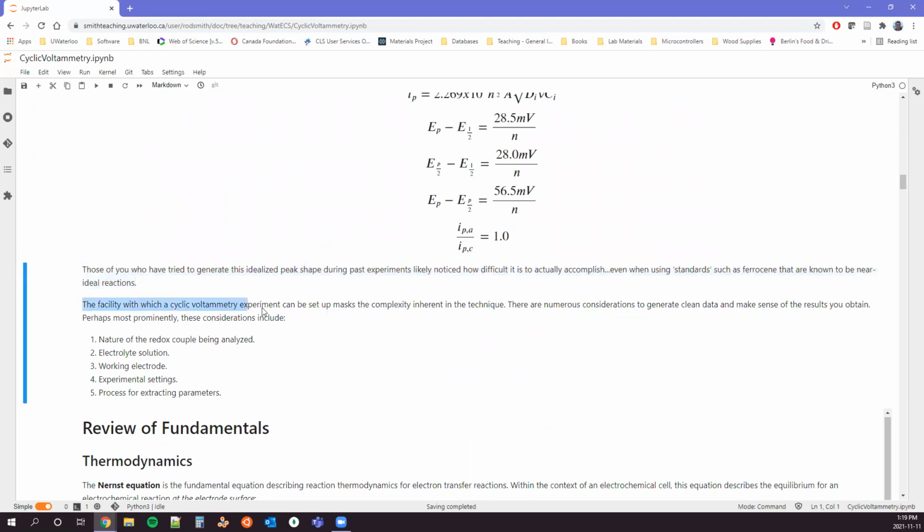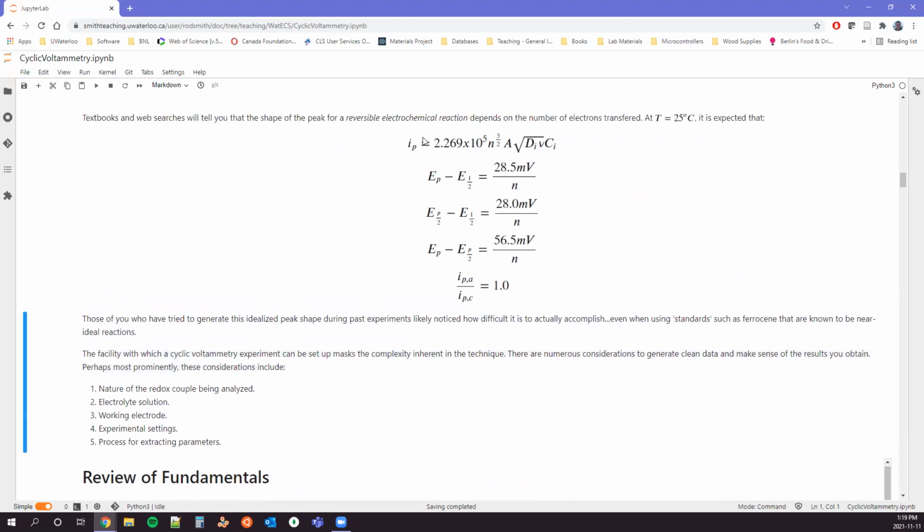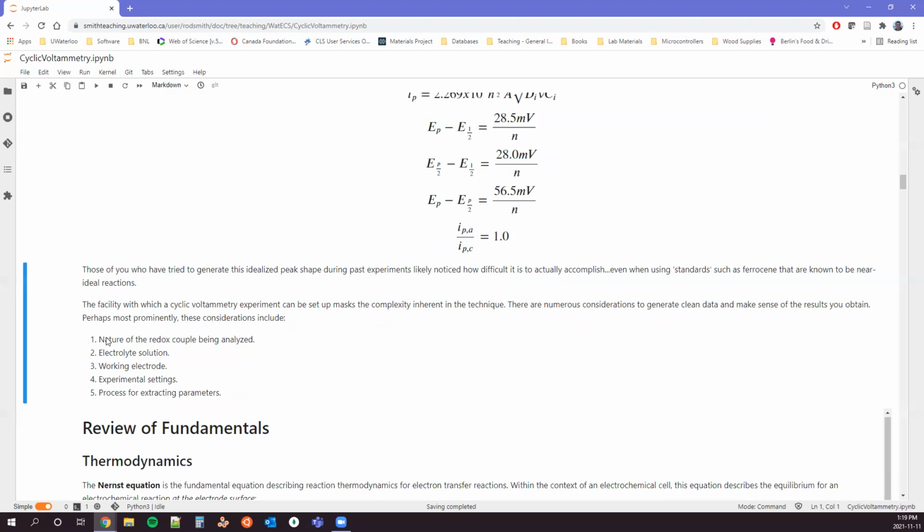And so what we're going to look at moving forwards is understanding when is good enough, right? I don't think we should necessarily strive for hitting these perfect numbers all the time. What we want to do is have good control over the system and be able to analyze changes in behavior as a function of your perturbation, which in cyclic voltammetry ends up being your window range and your scan rate. And a number of things are going to impact exactly what you see.